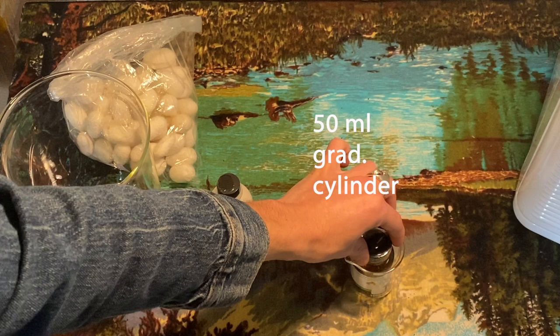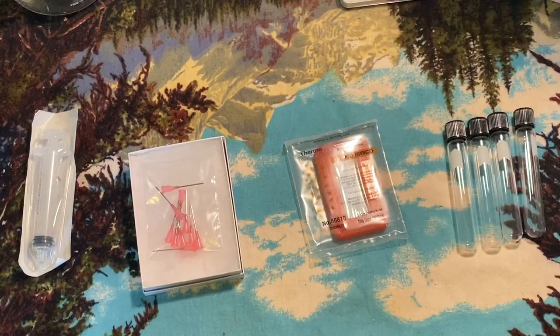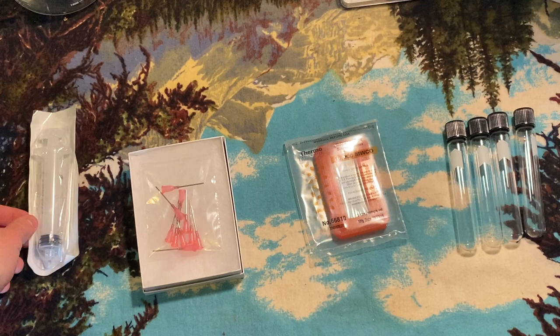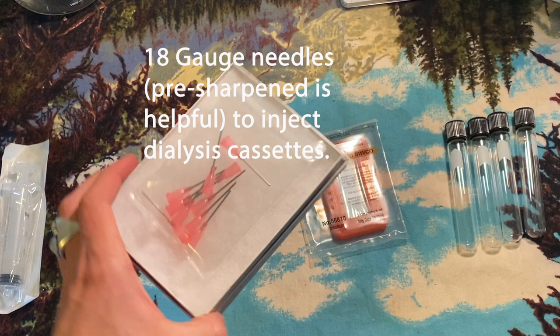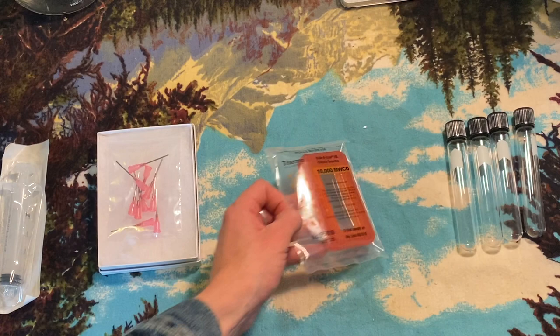Lithium bromide is a seriously dangerous chemical — I shouldn't have been touching it without gloves. A 50 milliliter graduated cylinder will be used for incubation. A 20 milliliter syringe is used for extracting, measuring, and transferring the silk. You'll want 18 gauge needles sharpened, because dialysis cassettes are really hard to pierce through.